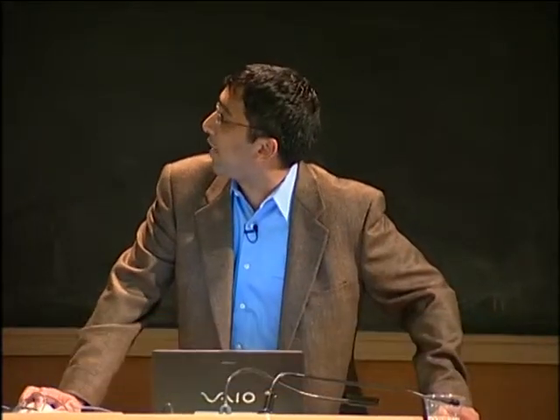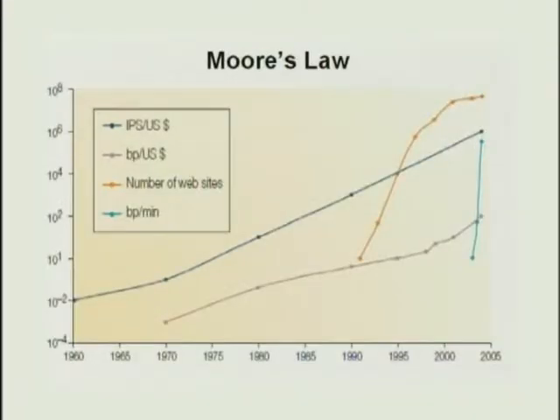The analogy has often been made between sequencing and Moore's Law, which was primarily conceived of in relation to semiconductors. But when you plot the throughput of sequencing and the cost of sequencing, they essentially follow exponential trends similar to that. As you can see here, exponential trends are not guaranteed to last forever.